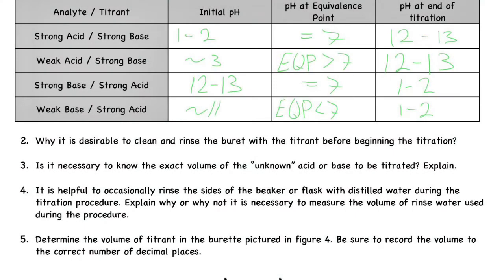The most important thing to note when completing background knowledge is the chart in question 1. Knowing what type of pH each titration has at certain points can not only give you hints on what type of acid and base you should use, but also what indicators should be used to indicate when the equivalence point of the titration is close.